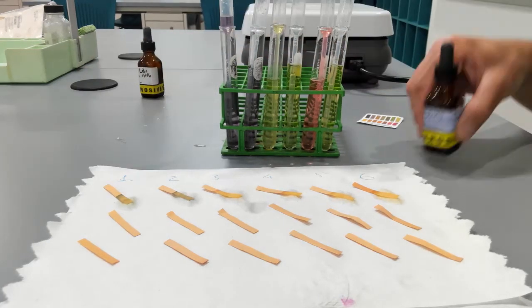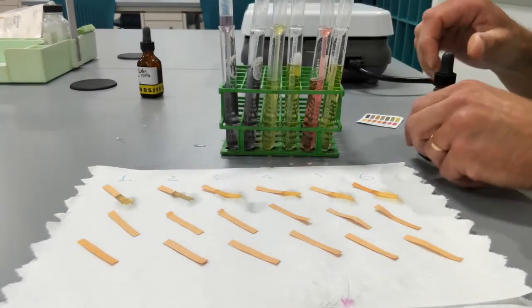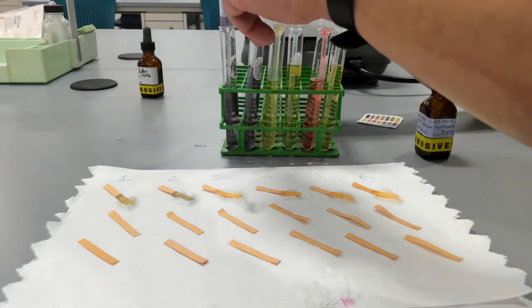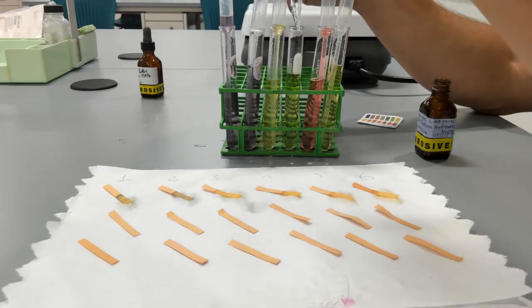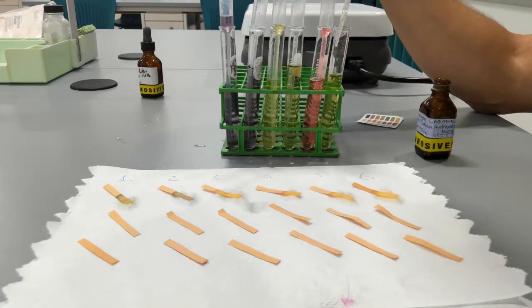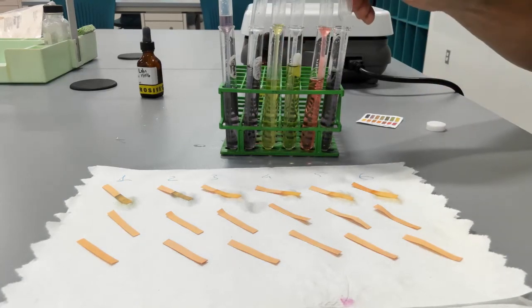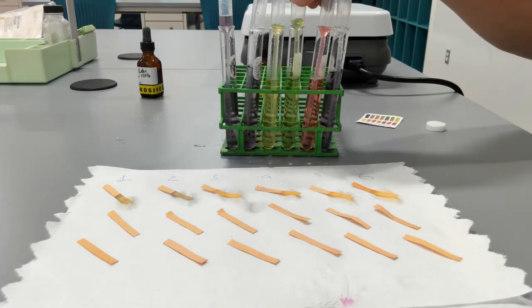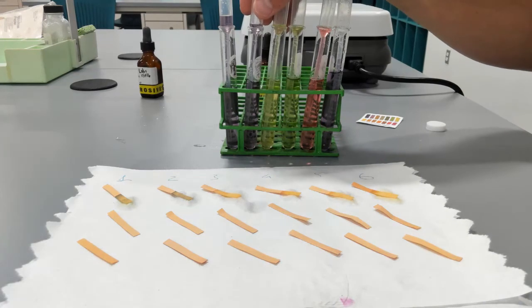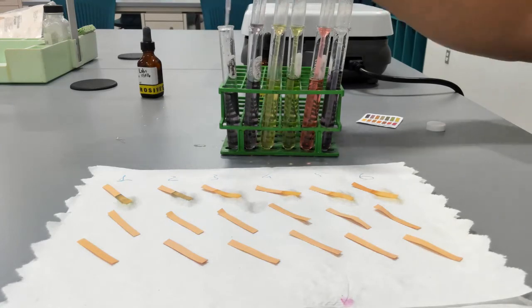Next, I'm going to add 1 drop of sodium hydroxide to the tubes 2, 4, and 6. So you can see that only water changed the color dramatically. And now we're going to determine the pH of all these solutions after the addition. So let's take a look.